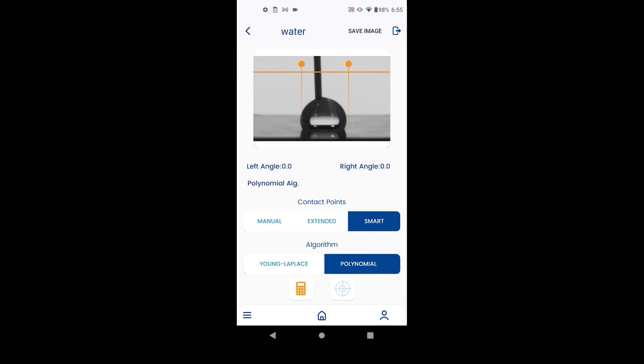Here user only needs to provide an estimate for the baseline and left-right contact points, the system then auto-detects the exact contact points.